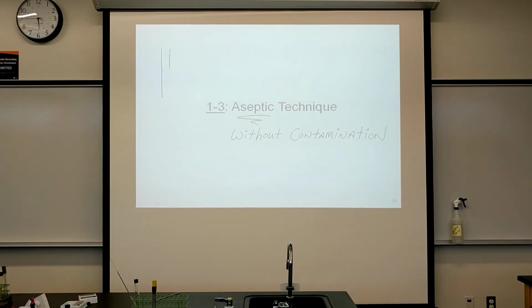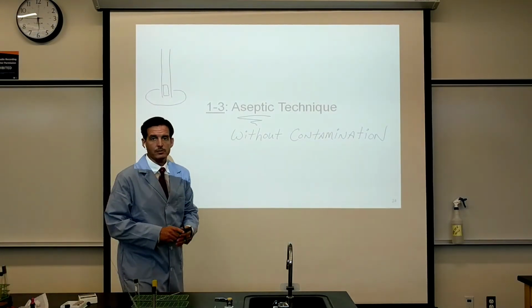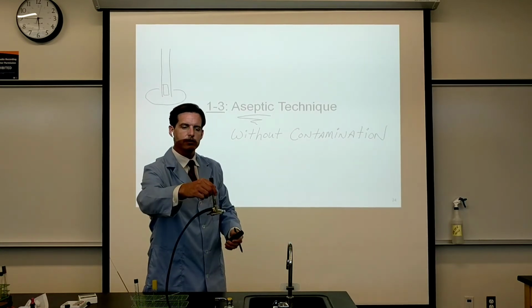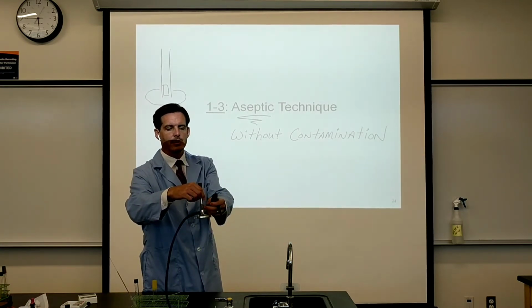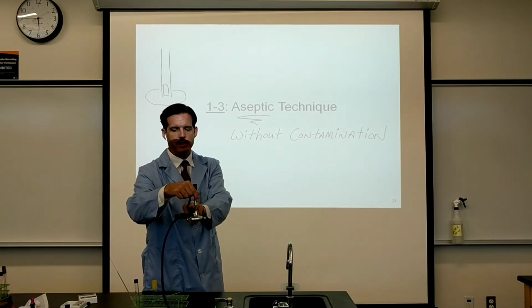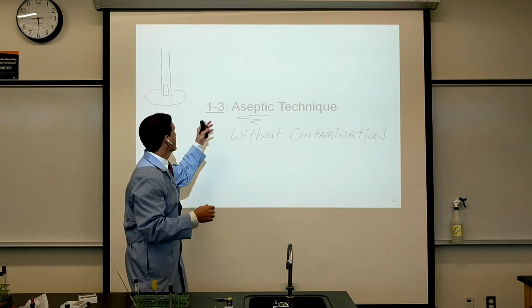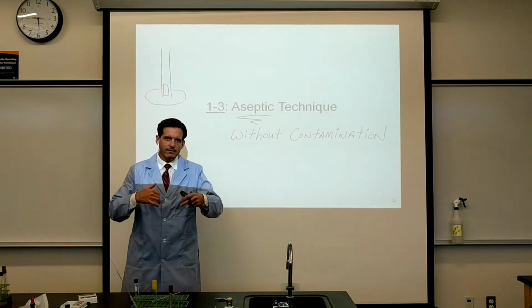You have your Bunsen burner standing on a little stand, and at the base of the Bunsen burner barrel there will be a hole, actually multiple holes. There are 4 holes on the Bunsen burner, basically straight ahead, and then at 3 o'clock, 6 o'clock, and 9 o'clock around the Bunsen burner. And those let in air so that it can feed the fire.